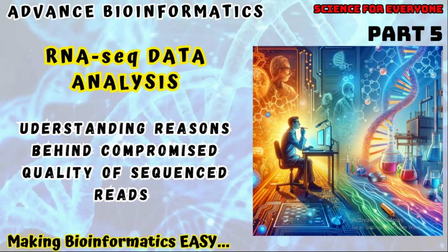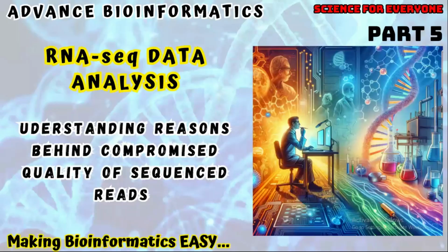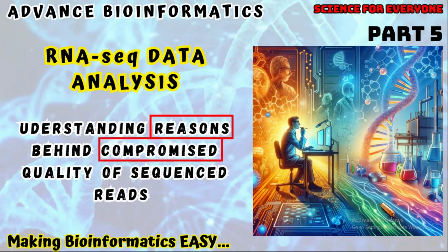Briefly, I started this video tutorial series from the experimental design or experimental workflow. Then I told you what sequencing is and how it is performed, and now we are understanding the sequencing files. In understanding the sequencing file, you should know about its structure, its quality, and the problems behind compromised quality. After you are well acquainted with these steps, you can easily proceed with the sequencing data analysis. So start from the first part of this video series, and everything is in a flow, so you can learn in a very effective way.